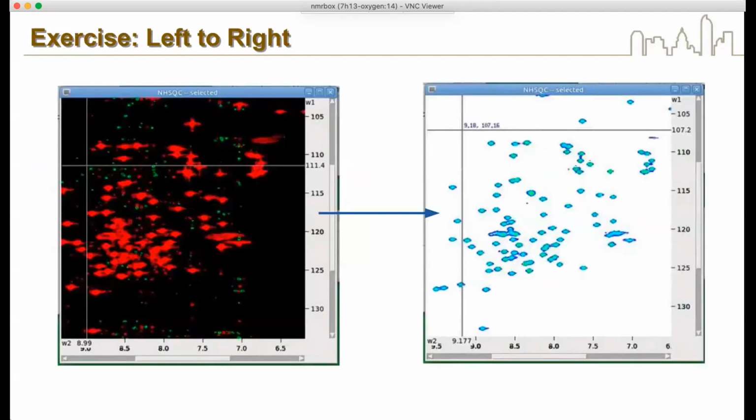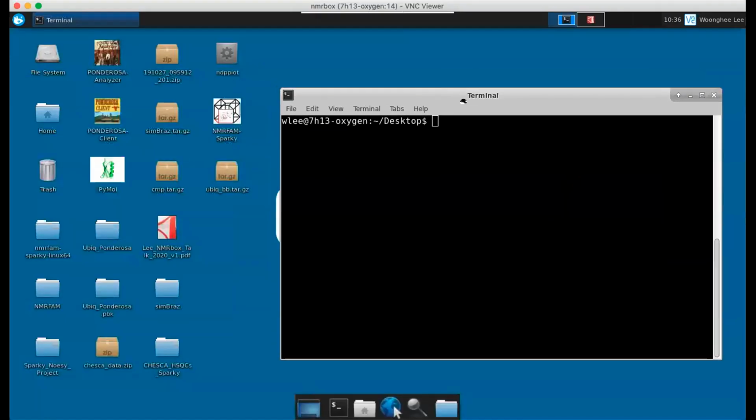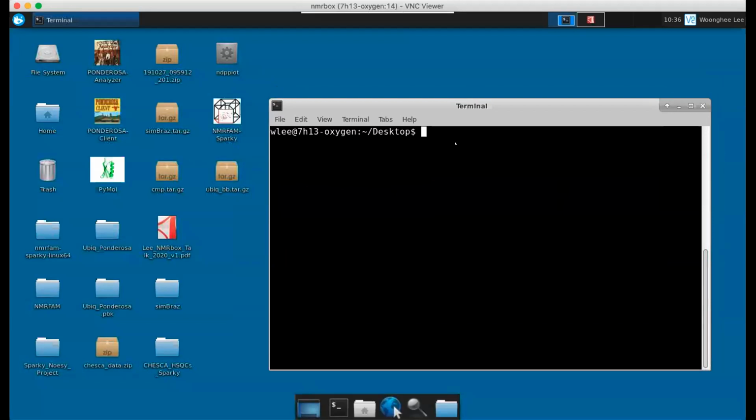So moving towards the hands-on, I will open the NHSQC file, UCSF, directly, and then change to a white background, and then we'll change the contour, and then suppress noise by resetting the threshold. So I'll change my window to the window without the presentation.